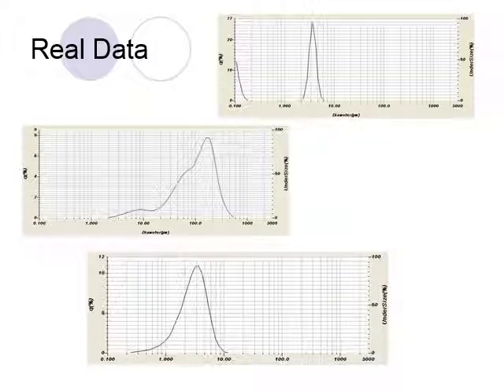These are what real particle size data looks like. These are all actually taken on my Horiba system at H&M. And you can see this is sort of the kind of stuff you'll look at. In that first one at top, you actually have a fairly narrow, very tall peak of a certain size, and then you have a lot of nanoparticles on the other end. So the math of that can be difficult. Your population is fairly monodispersed in one aspect, but you also have another mode of small particles.